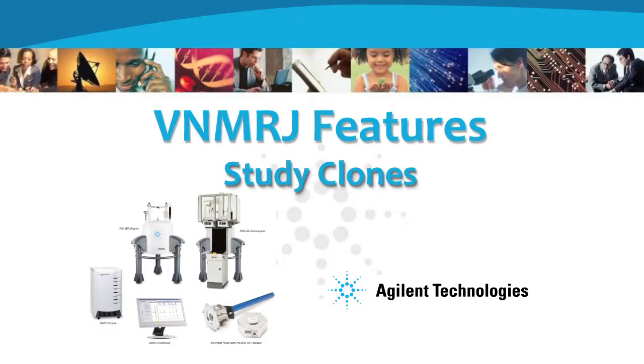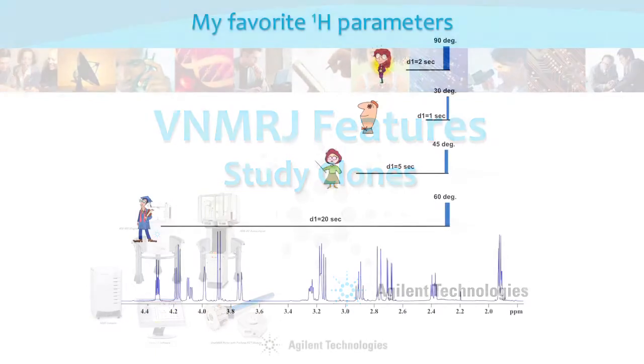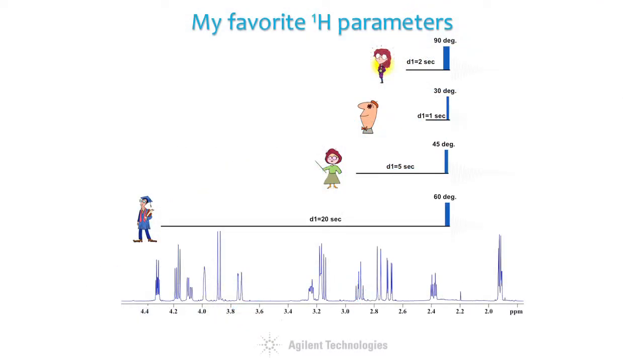There are as many different experimental configurations for Proton NMR spectra as there are spectroscopists that run them. Local workflows and requirements mean that everyone needs something a little bit different than everyone else. Occasionally, even the same person might need different conditions at different times or with different samples.